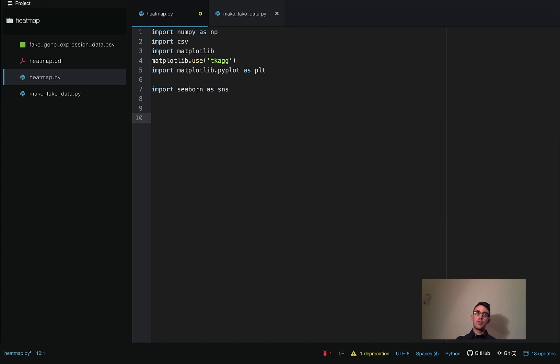It's mostly just going to be loading the data in — that'll be the tough part. Then the actual heat map is just going to be a couple of lines.